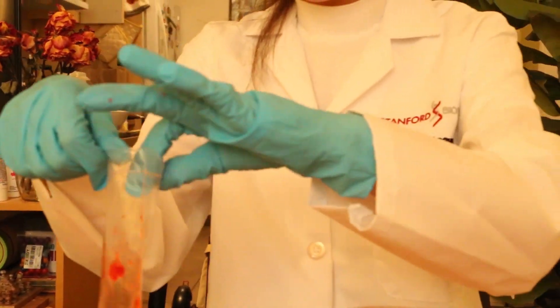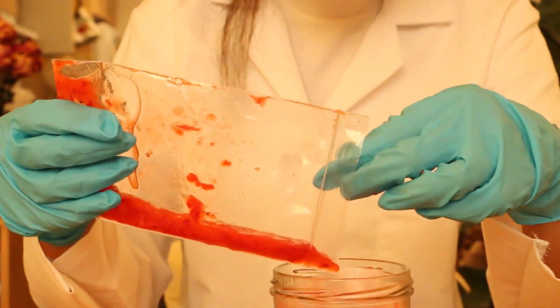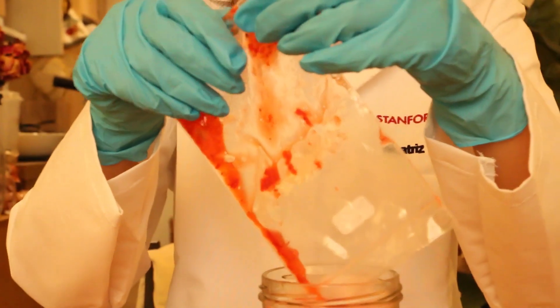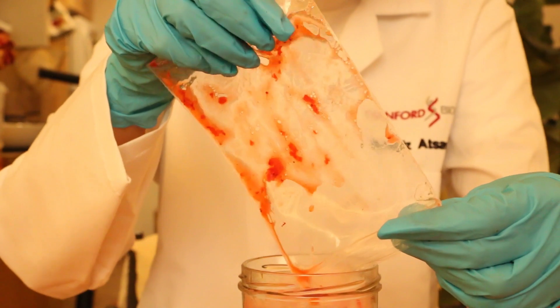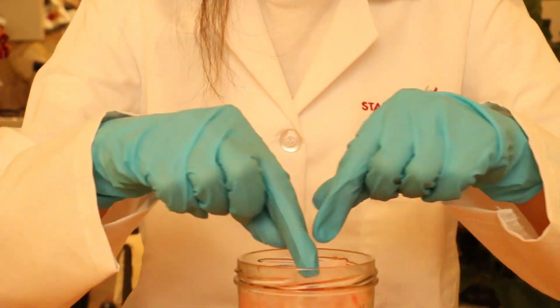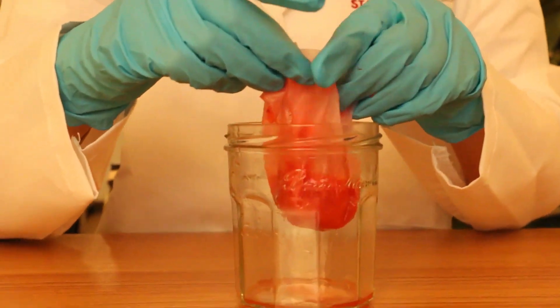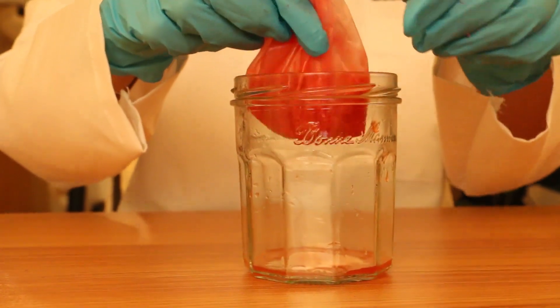Now we have the DNA separated from the other cellular components. To filter out the DNA, we're going to use this coffee filter and place it in this cup. The filter will catch all of the cellular debris and proteins that we've separated out, and allow the liquid with the DNA to flow through.